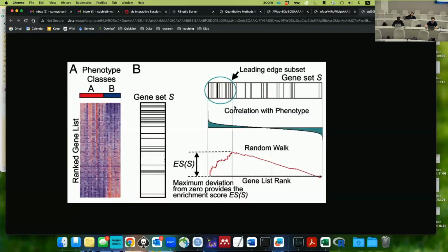So when you're ranking the genes, the top and the bottom, they're both DE genes. The top are the positive DE genes, the upregulated genes, and the bottom are the downregulated genes. So at the beginning and the end of the random walk, you will both take very big steps, and in the middle, it's the small steps. So the enrichment, is it the length of the peak? Or it's not the horizontal distance, it's the vertical. It's how far you can walk away from 0. Okay.